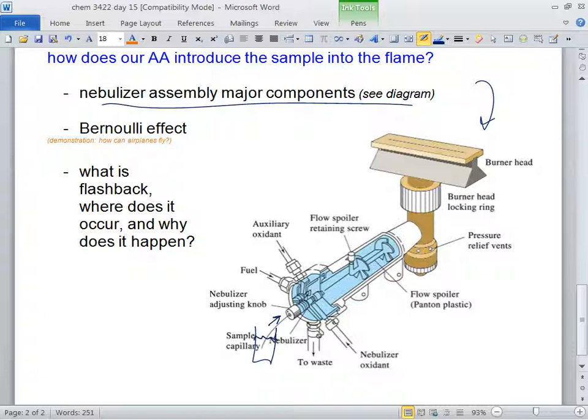We're supposed to have all these safety features on our AA that stop flashback. I say supposed to because they've never been tested. Who wants to test that? I think what they're talking about is more like the O-ring nature of the thing. In other words, if something explodes, they just pop off. I think it's nothing electronic, it's just a physical design.